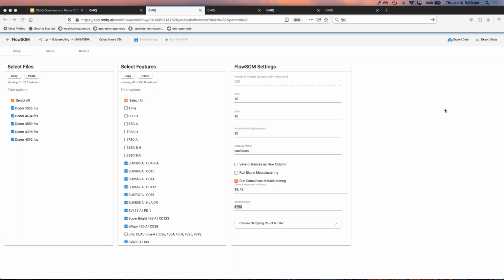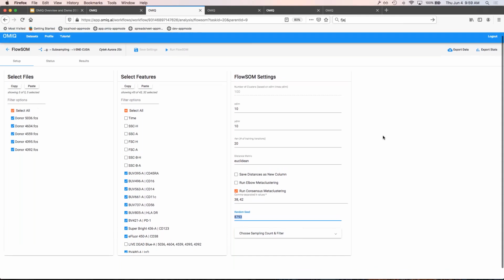Okay. When you run the t-SNE, does it create a new calculation of t-SNE with all files included, or just a separation of the already concatenated file with the t-SNE results? So I don't know if I understand this question perfectly, but it's a good generic point of discussion, which is in OMIQ, we take care for you of concatenating data for the purpose of running an algorithm. This is always how you have to run an algorithm for most algorithms. You have to concatenate the data, and then behind the scenes, we actually split them back out again for you. So you don't have to concatenate data as a manual step to run algorithms.